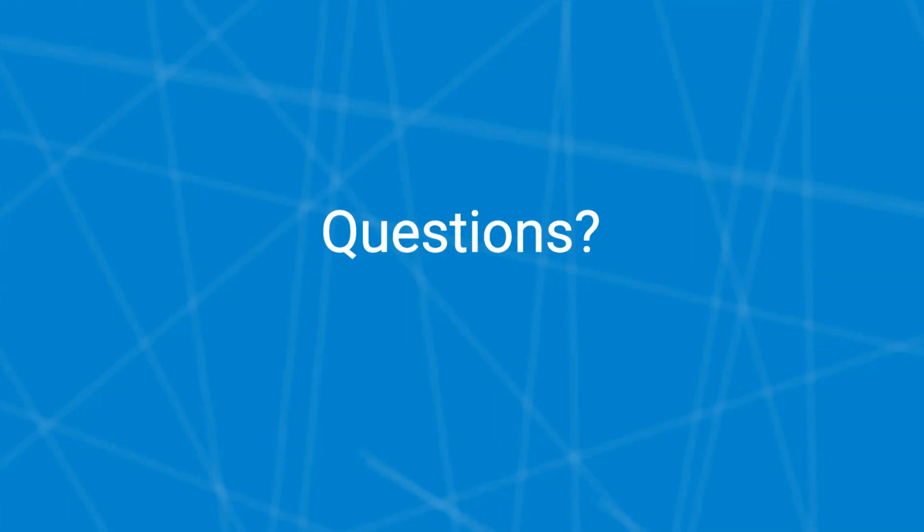And one other question that I skipped at the beginning is whether or not this handles replicates. I would assume this person is talking about sample replicates, and the answer could be yes or no, depending on if you wanted it to be, right?